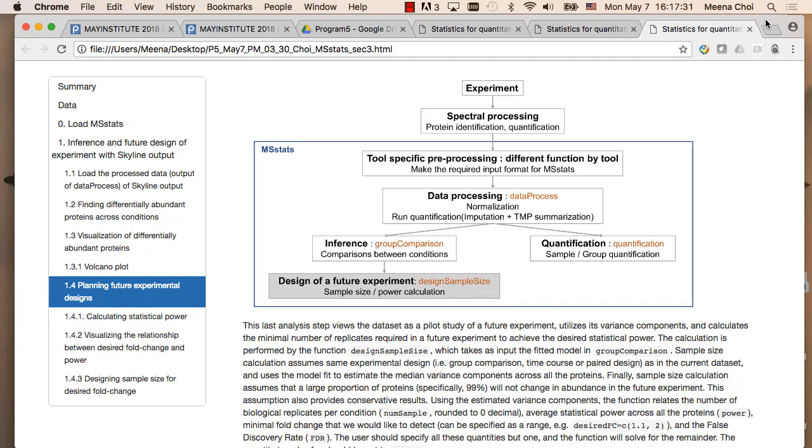If you summarize, it's only 3 functions, very simple. However, in between we use the visualization function, and here also a visualization function, and then we can get a p-value for our group comparison. So this is what we talked about so far.